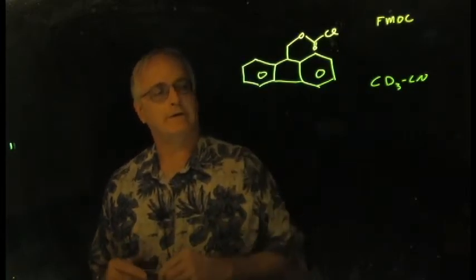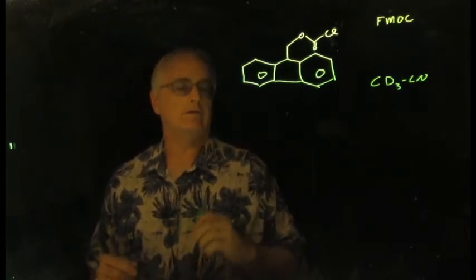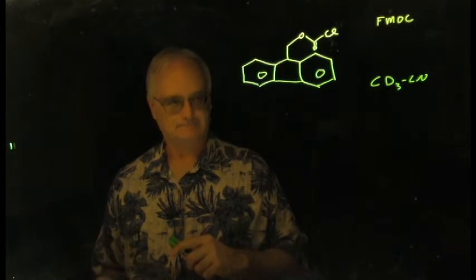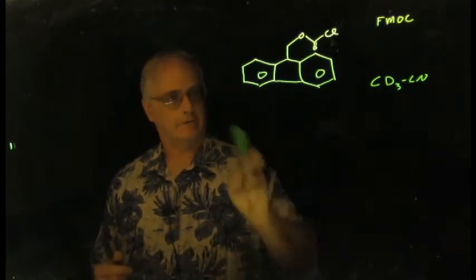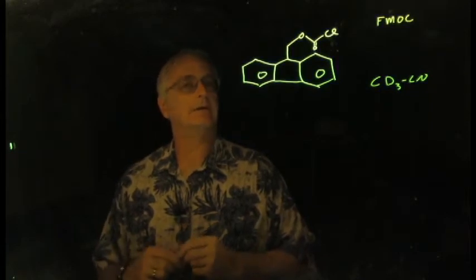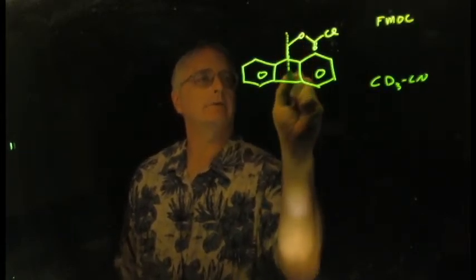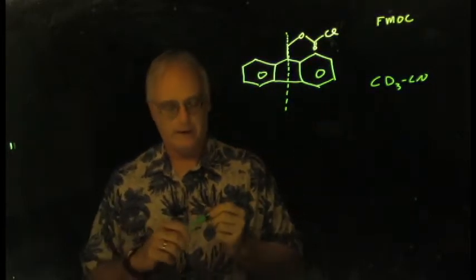And so it's time to take a look at the structure of FMOC and what we would expect to see in its proton and its carbon spectra. Now, here's the structure of FMOC, and it is critical to note that it is a symmetric structure. There is a plane of symmetry right down the middle here.